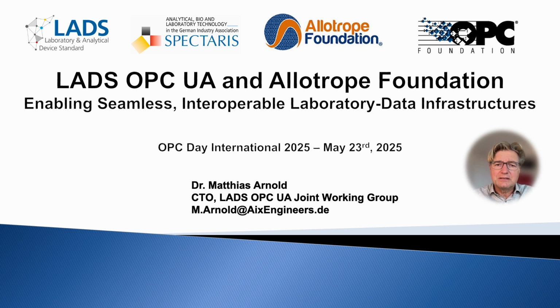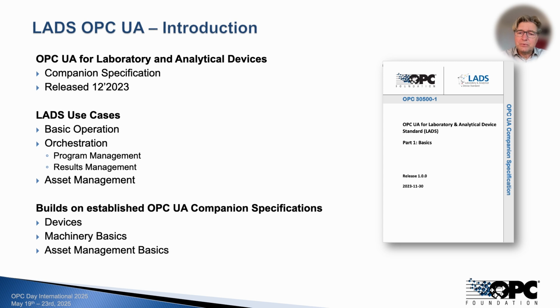Let's start with a quick look at LADS OPC UA, the companion specification for laboratory and analytical devices. It's an official OPC UA companion specification released in December 2023.